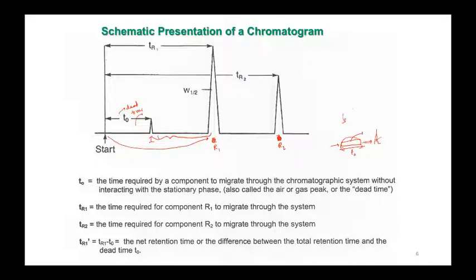So this is the concept of retention time of the component if we use any kind of column. This is common for HPLC as well as the GC column, gas chromatography. Both are the same, because in both cases you have some kind of solid surface, a stationary phase there also. So this is common for both separations. Now let us move further.